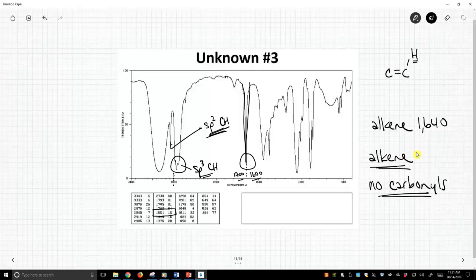Now we have one more peak right here. This is just beyond 3000. What is this? The IR picks this up as two separate peaks, both a little bit past 3300. And this is broad. This looks like an alcohol. Now, I confess that if you're new to IR, it's easy to look at that and say, wow, that's not just broad, pal, that is very broad. But when I say that things are very broad, I'm normally thinking of a carboxylic acid.